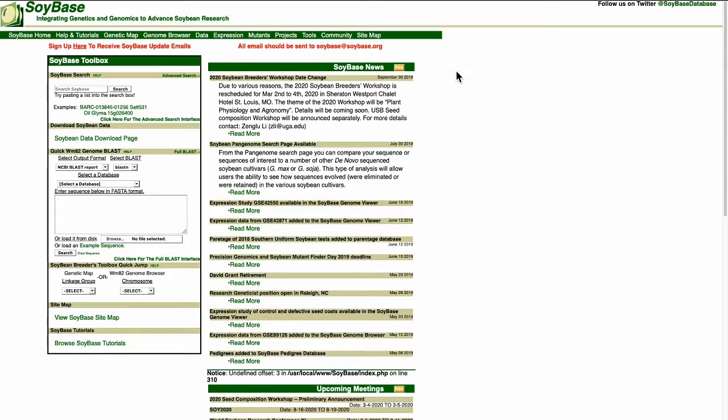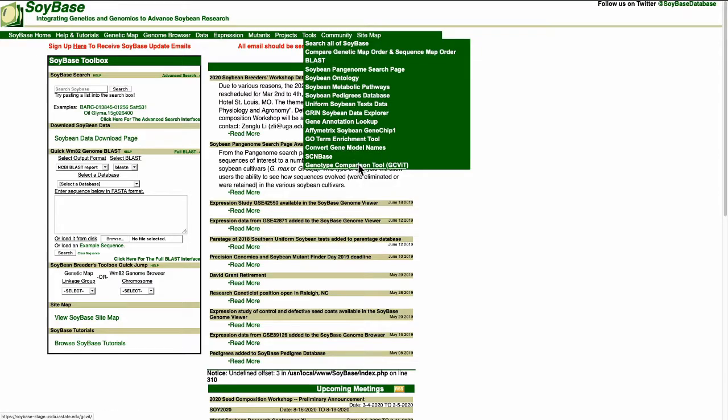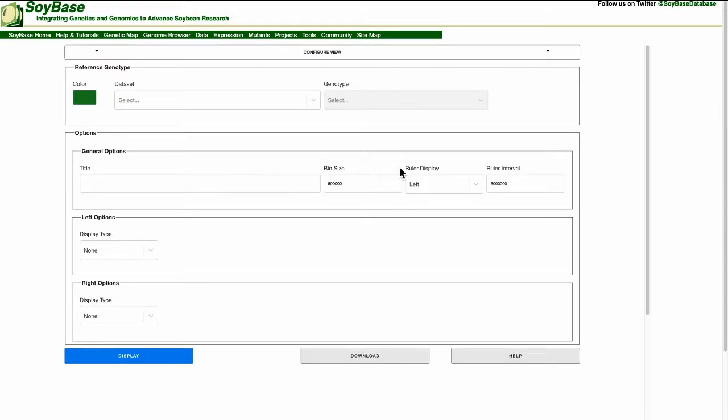To get to GCivit from the SoyBase home page please look under the Tools tab. Under that tab you will see at the bottom Genotype Comparison Tool or GCivit. Now click on it. Now we are at the GCivit front page.